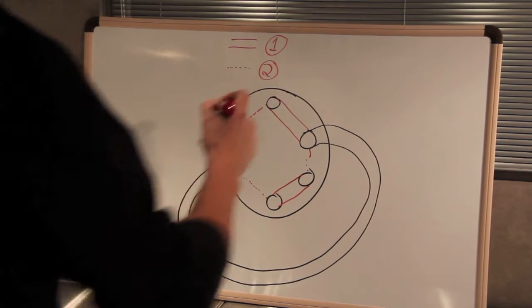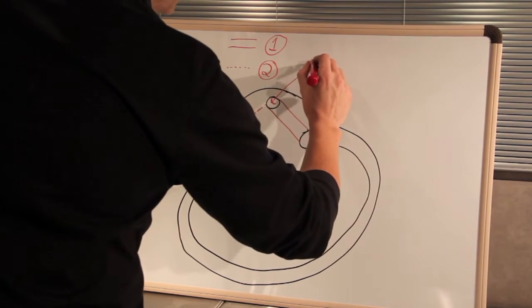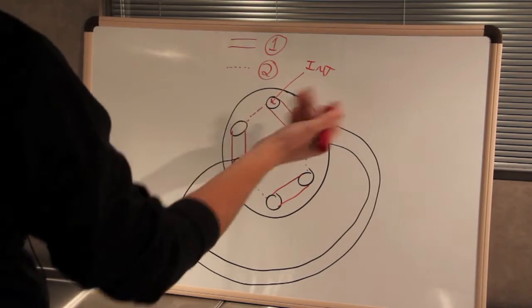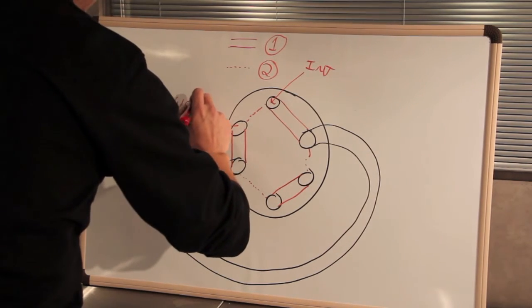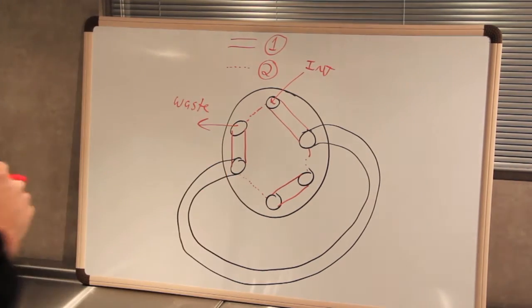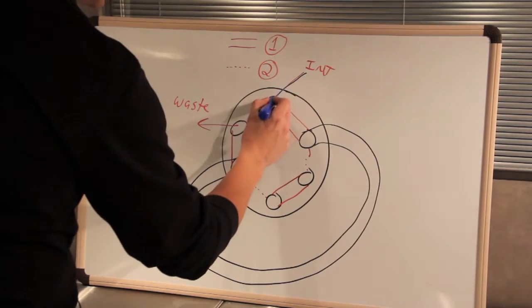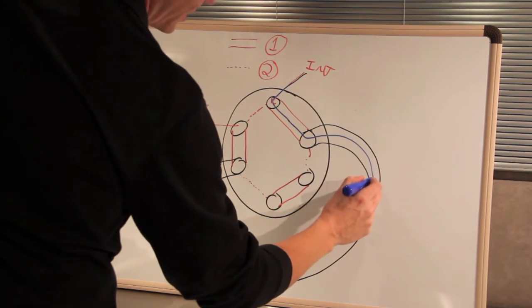You can see that this port right here is what is hooked up to our injector. Now that could be a syringe or that could be an auto injector. It doesn't make any difference. And this port right here is going to waste. So when we load our sample it's going to be pushed through this port, through the rotor, and through the loop.